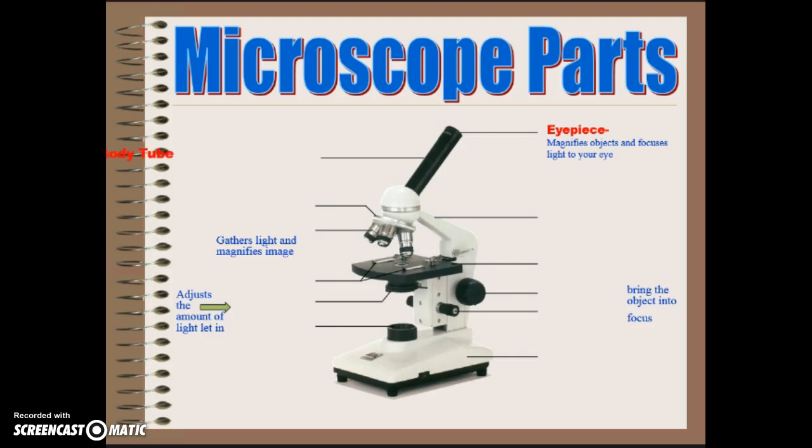Moving down the microscope, we have what we call the body tube. It is a large, long, dark tube that helps direct the light from the microscope to the eyepiece to your eye. Next up, we have the revolving nose piece. It is a part of the microscope that does exactly as it says, revolves. It allows you to use the different objective lenses.